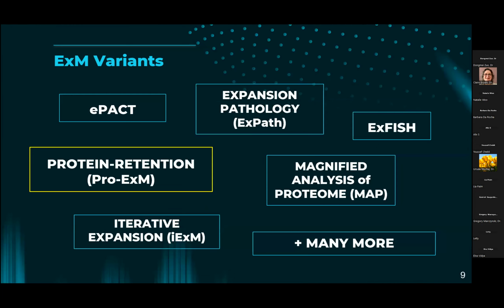And then these are the different variants. So I've already mentioned XFish and XPath. The most commonly used one would be protein retention, or ProExM, which, exactly as it sounds, retains the proteins of interest. But there are a lot of other techniques out there. This is by no means exhaustive.